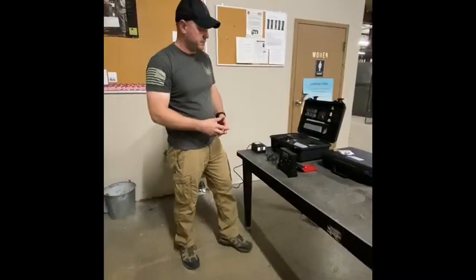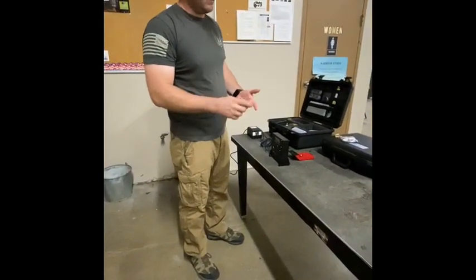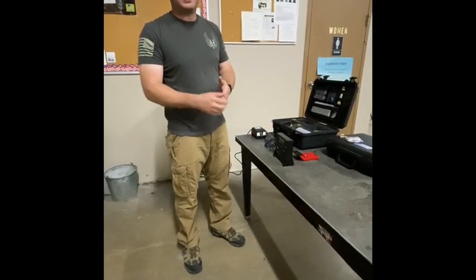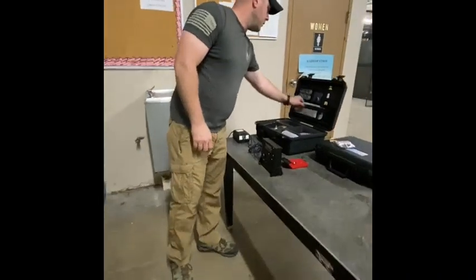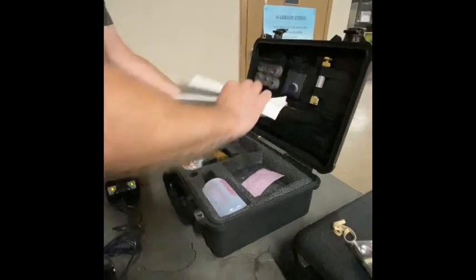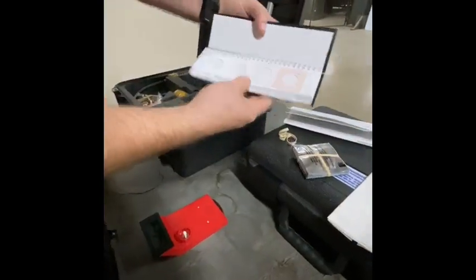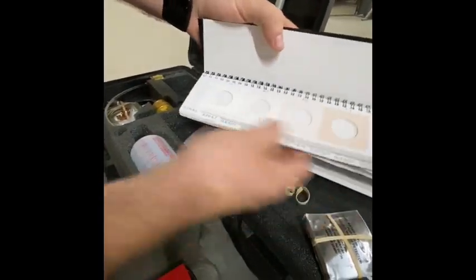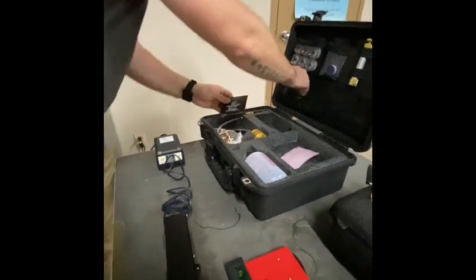For the AquaGlow test, a couple things to remember. The test pads and the calibration pad, always use the tweezers. Do not touch them with your hands. Do not do anything like that. It will contaminate the sample. So in this zipper bag, you have your calibration tools. You have paper towels. This is for your millipore test to check for the color of the pad and compare for contaminants in the fuel.